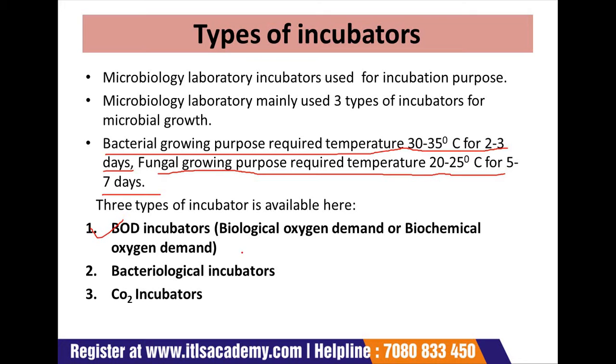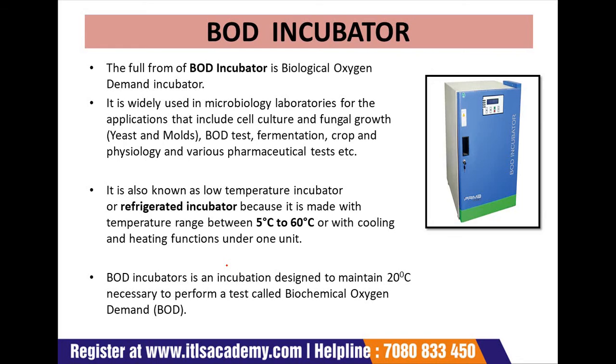The first one is the BOD incubator, whose full form is biological oxygen demand or biochemical oxygen demand. The second type is the bacteriological incubator, and the third one is the CO2 incubator. In this lecture we are going to discuss only the BOD incubator, and in the next lecture we will discuss the remaining two types of incubators.